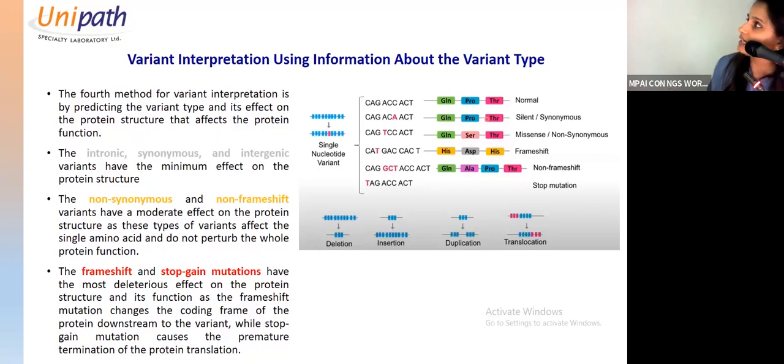Now this is strange because this is shifted. That's why this is a frameshift. And here we can comment that this results in the protein stopping there. So based on that, these are criteria which can be applied.